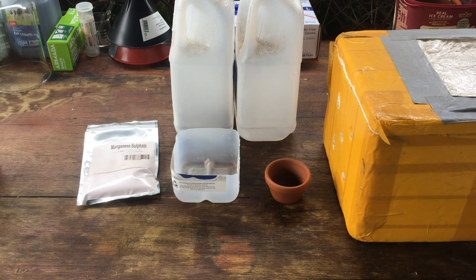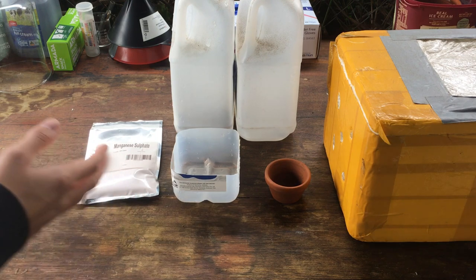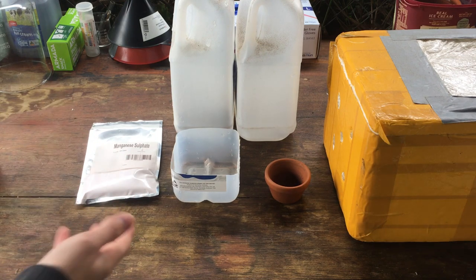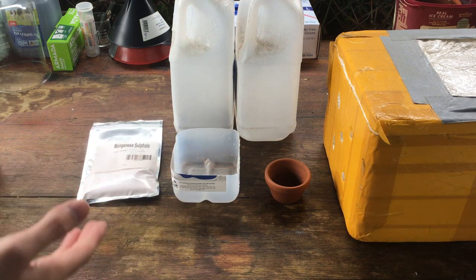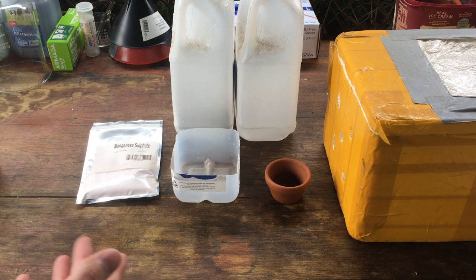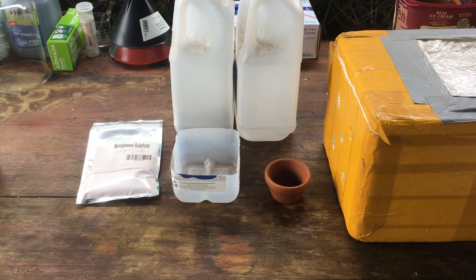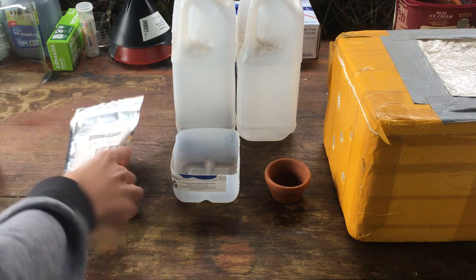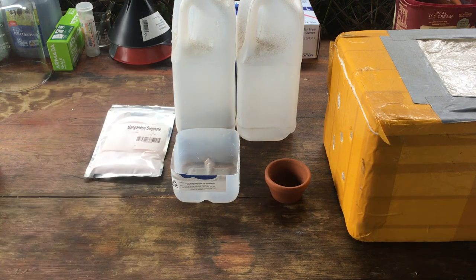Just by the way, before we start, the reason I'm using manganese sulfate as a starting material is: one, because it's cheap — definitely cheaper than manganese metal — and it can actually be made from manganese dioxide, which is even cheaper. You can even get it from those big lantern batteries, zinc carbon batteries. NerdRage has a video on that. So manganese sulfate seemed like a good place to start.